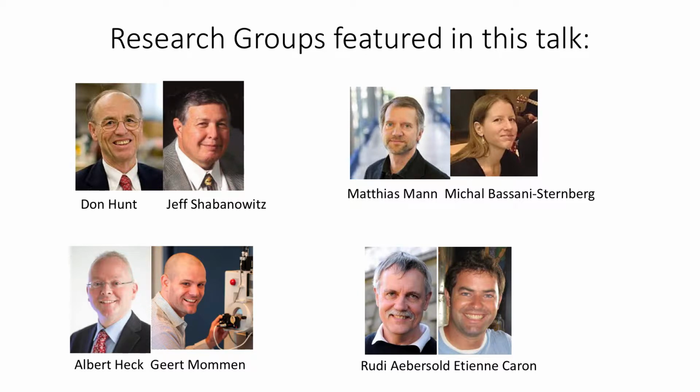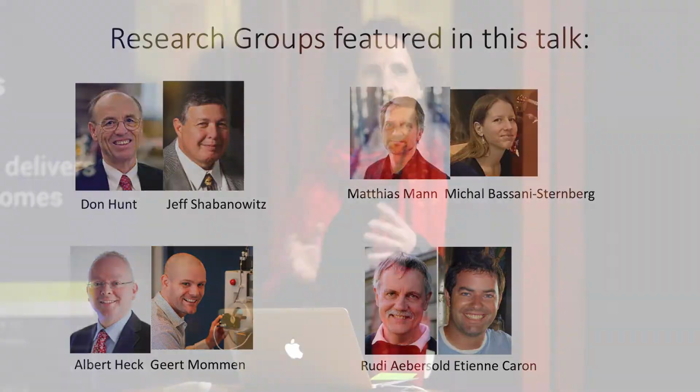And so this talk will be very technical, and I hope I can try to tell you why it is hard, and I agree with the previous speaker that detecting these peptides by mass spec might not be as straightforward as it seems. So that was actually the perfect introduction. While everyone else is positive, I'm giving you the reason why things might fail.